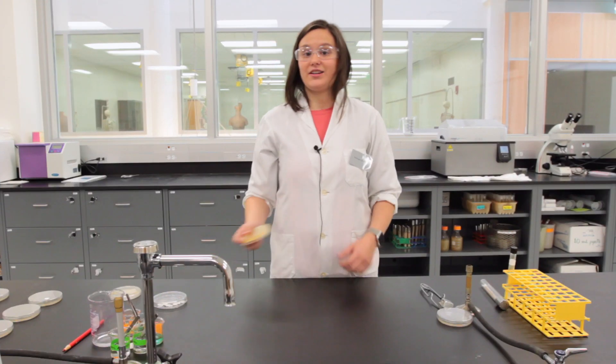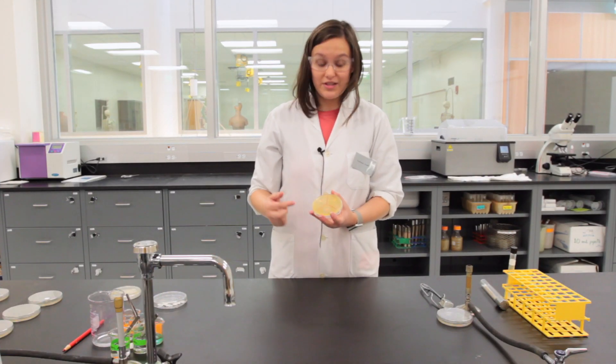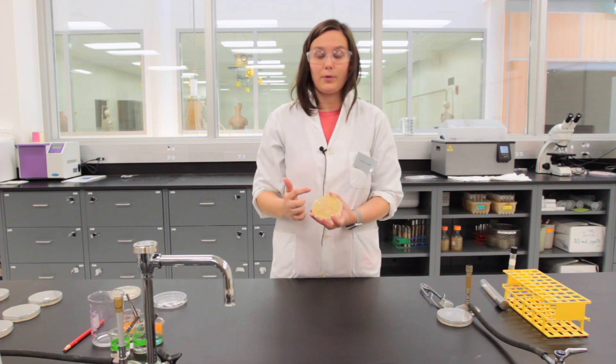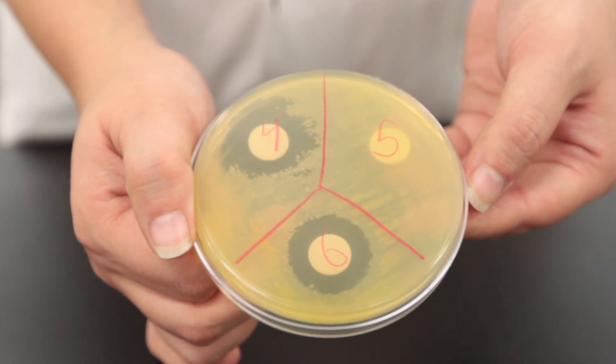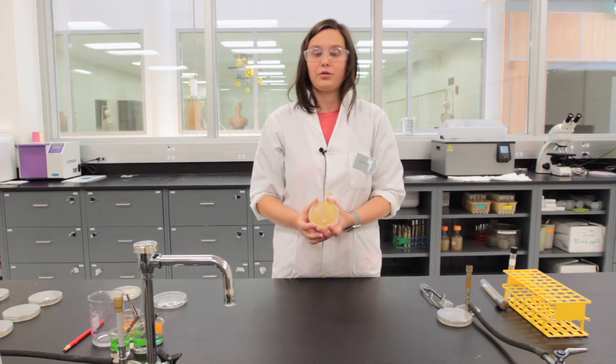After the plate is done incubating, you'll see that the confluent lawn has grown up around the plate except for any zone of inhibition around each of the discs. This may differ organism to organism, but if there is any clearing around the disc, that means that that antimicrobial inhibited the growth of that organism.